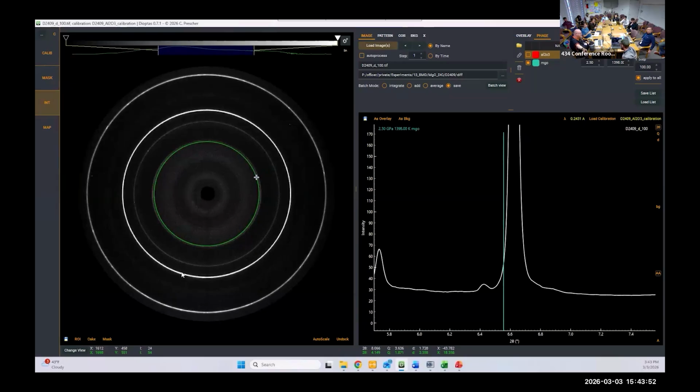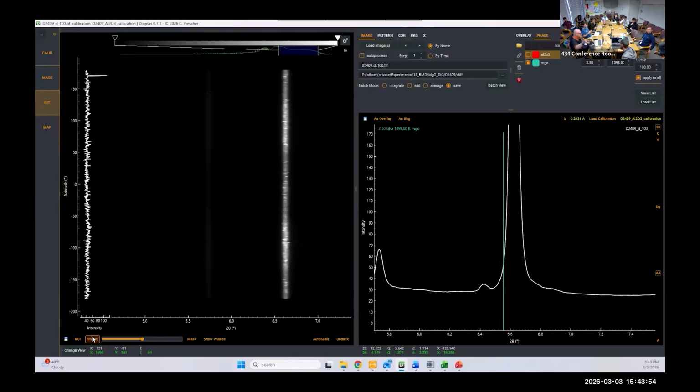It's forward scatter from the beam that gets in between the anvils that come through. So everything along that path is going to be brighter. Oh yeah, that's true. That's an overprint on it. That's a good point. That's the same thing that we have, except ours is slanted at that 54 degree. To do it quantitatively, you want to take the diffraction as a reference and remove the background. Right. Yeah, that's a good point. So you already have brighter stuff at the top and the bottom, because you're coming through an amorphous gap on the one side, and there's an amorphous gap on the back. Yeah. And then there's transparent diamonds.